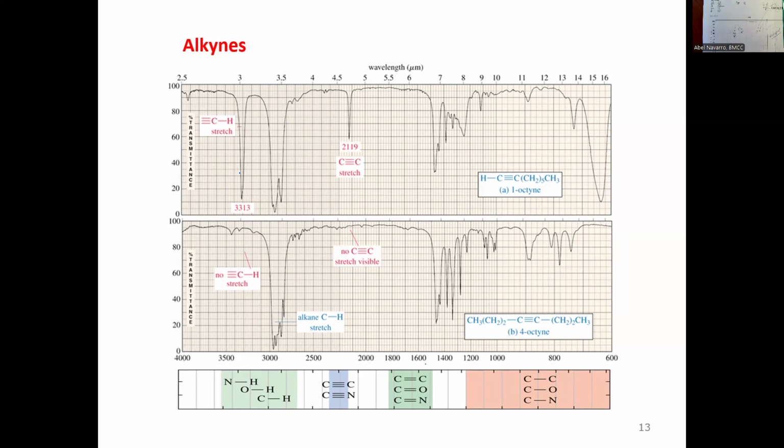CHSP. I'm just trying to erase that. This one happens again. All right, so the CHSP, and now you say, like, oh, professor, why is that peak so strong? Look, it goes from 100 all the way to 10%. Yes, I mean, once again, the molecules sometimes are picky, and sometimes they show up really strong, sometimes really weak. There's really nothing we can do.